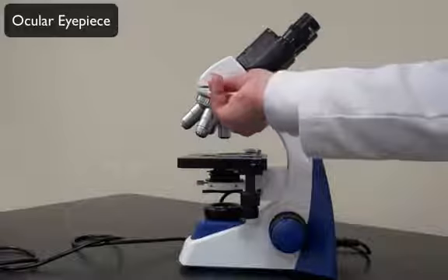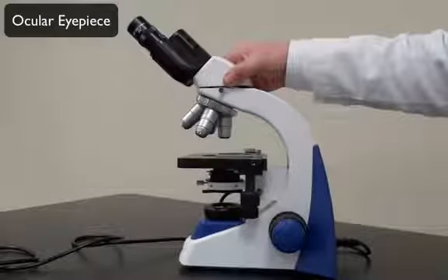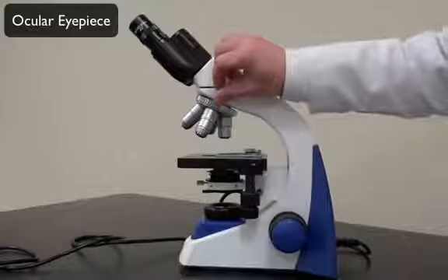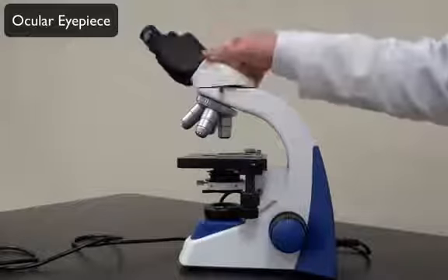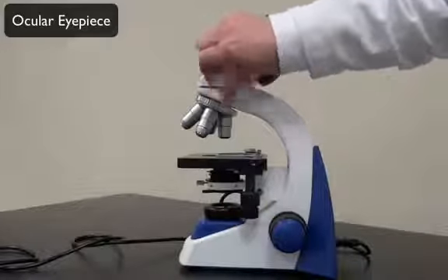Now we do have this little locking mechanism that once loosened can adjust the ocular lenses to a different position. So make sure that's loosened up before you actually start to swing it around. Otherwise you can strip that out.